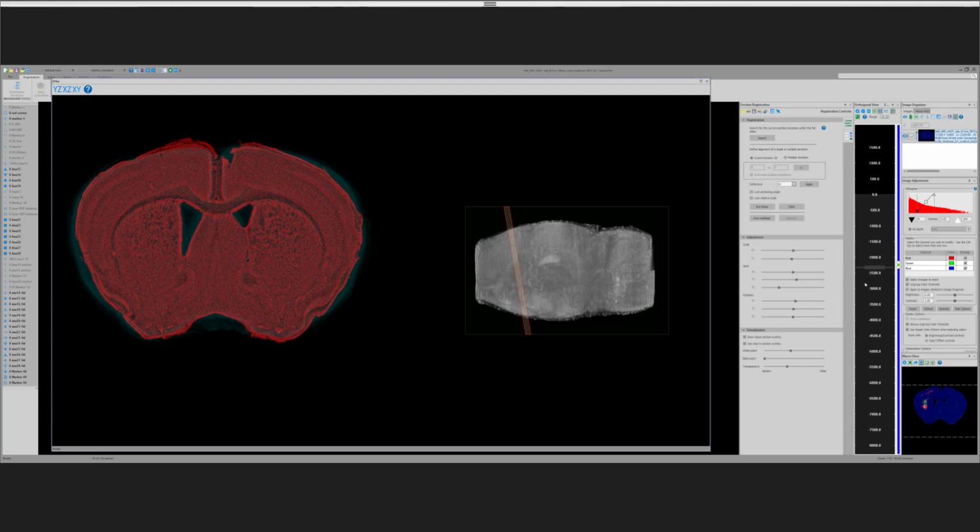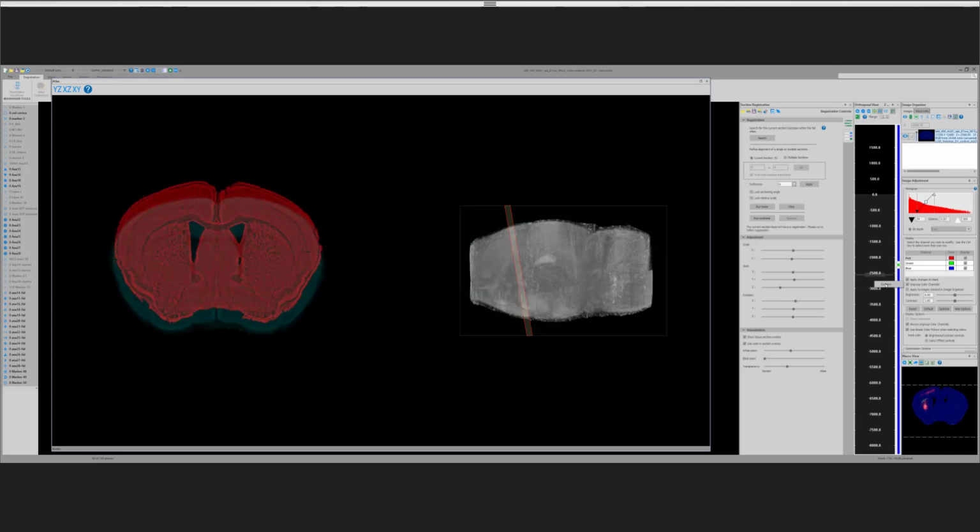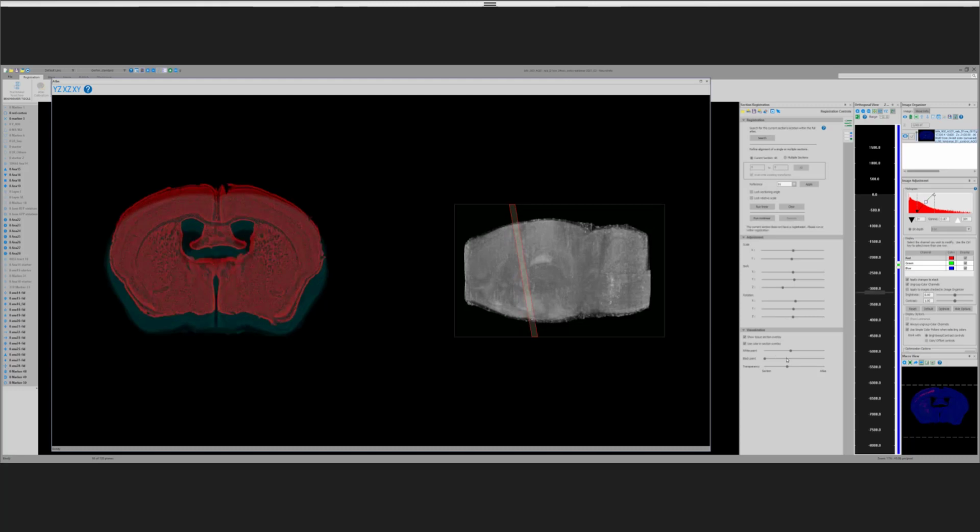And then I'll just do a few more. And I'll just jump in to say, of course, that the model that we have of the brain being sliced during sectioning assumes that when you're sectioning, you keep all the planes parallel. The knife always travels through the brain in parallel planes, and that's why this particular approach seems to work really well. Yeah, so this is another. When we're looking at the fimbria, the fiber tracts there, you can see how well that matches up. So by going through this, I can tell that this offset, these angles, work.